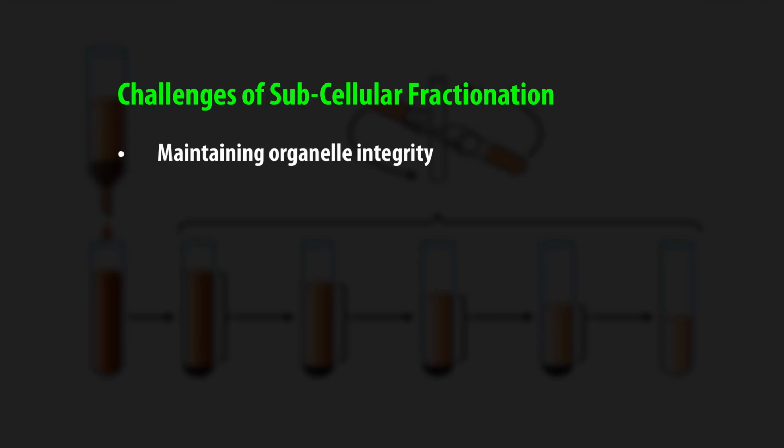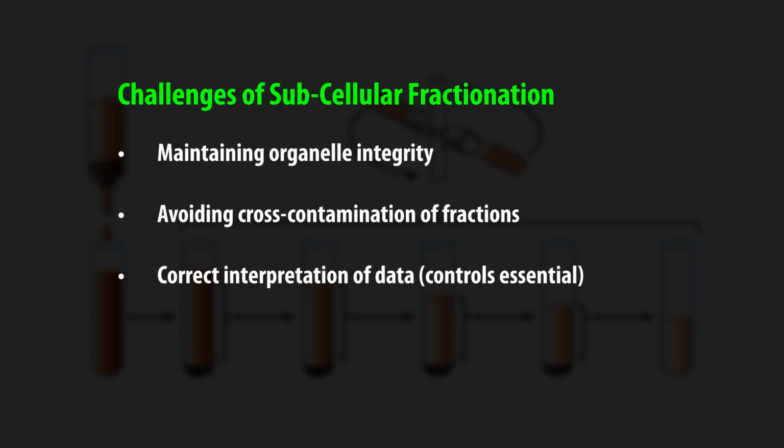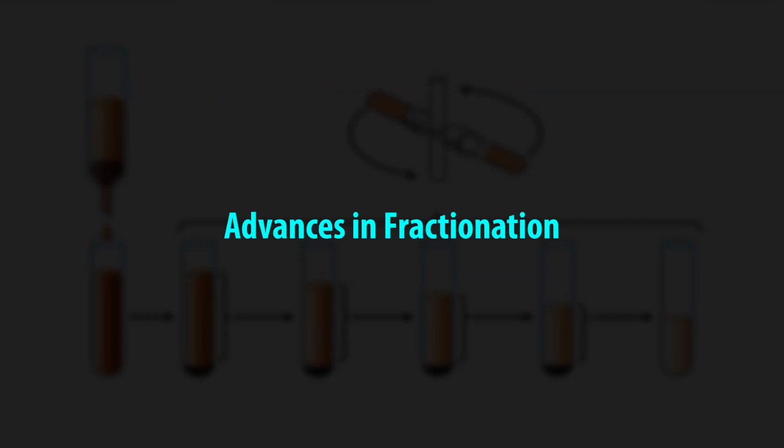Its integration with modern techniques like mass spectroscopy enhances its utility, making it indispensable for advancing cell biology and related fields. Challenges: maintaining organelle integrity, avoiding cross-contamination of fractions, correct interpretation of data, controls essential. High cost and need for technical expertise.